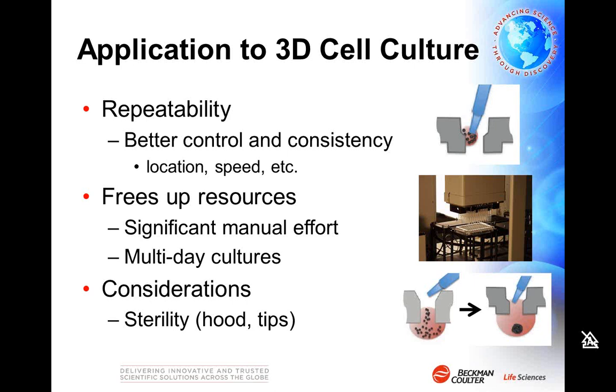With regards to freeing up resources, obviously these are not just your straightforward 2D culture where you can just throw media into a well. So it does require a bit more manual effort, and it's certainly easier to do it, say, 96 channels at a time than a single channel at a time. And also, because you're forming these 3D spheroids, these are multi-day cultures. So again, these are plates you're going to be coming back to day in and day out for anywhere from 5 to 12 days perhaps. So again, significant effort is required.